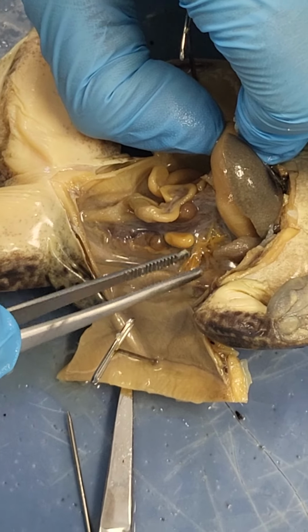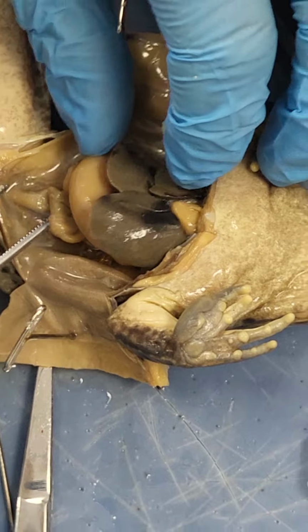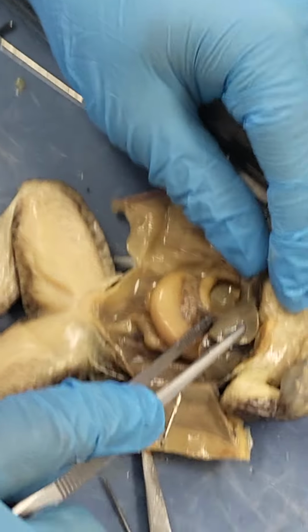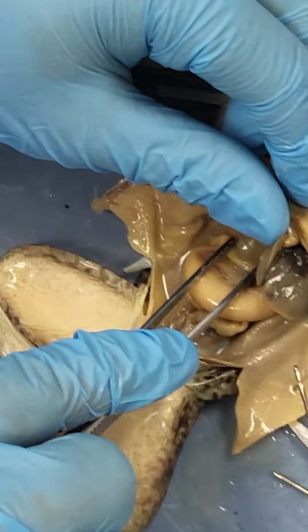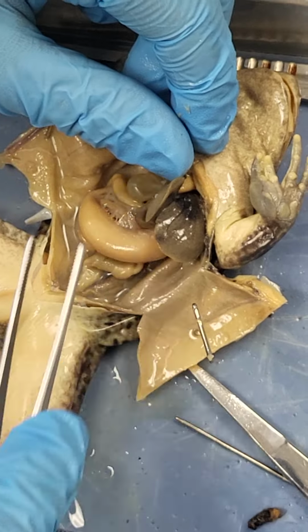Yeah. Look at this. Oh, God. Gallbladder. Gallbladder is next to the... Lift the lobes of the liver. There's the small green sack right here. Take it off? No, wait. You don't have to. It'll be good to see it in perspective, though.